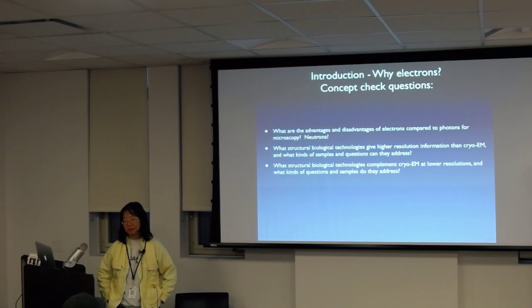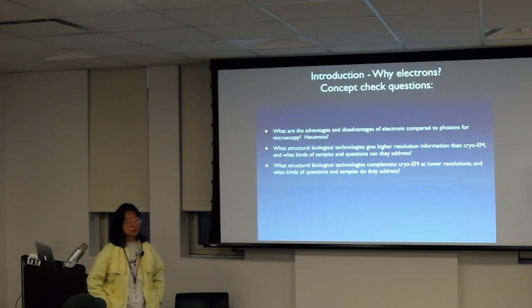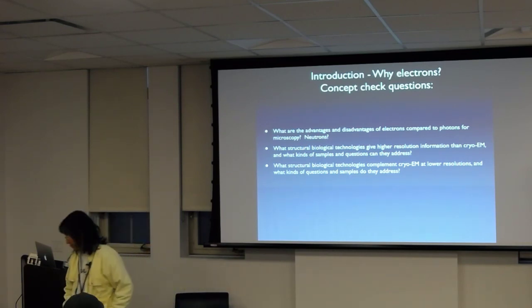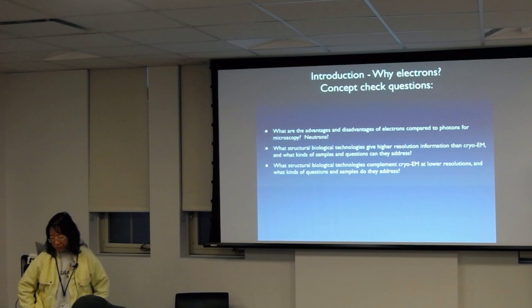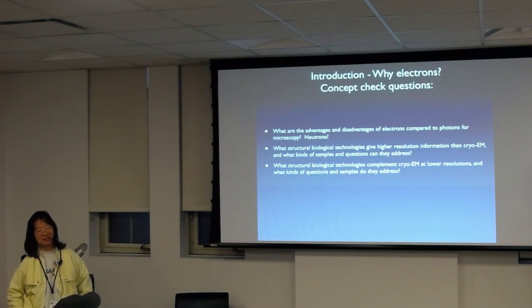And if there's anything else. There's electron diffraction, whether or not you consider that a separate technique. Yeah, kind of. Small angle X-ray, yeah, that's right. Time resolved X-ray. Yeah. EPR, DEER. Who cares about those? This is about EM. What about the third question?